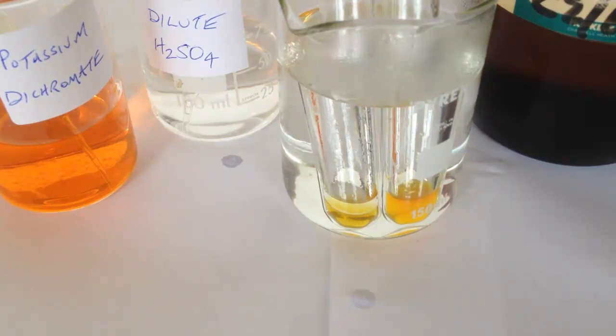So take a look at the test tubes. The test tube on the left has butanal mixed with acidified potassium dichromate. Watch how it changes in colour from orange to green. You can already see signs of it turning from orange to green here.